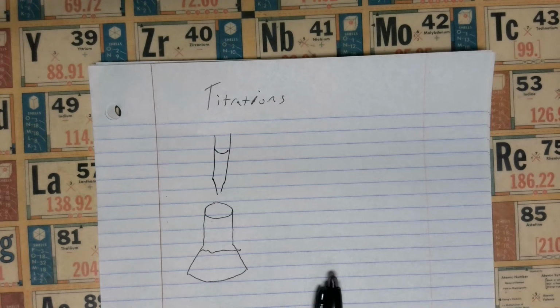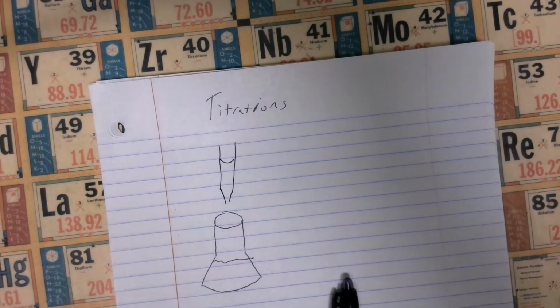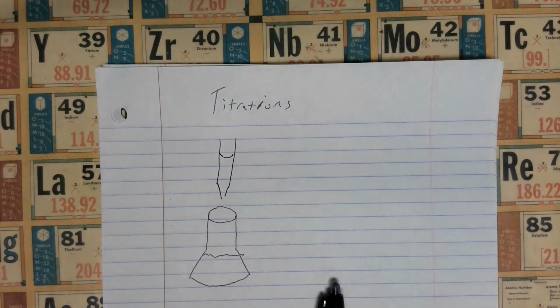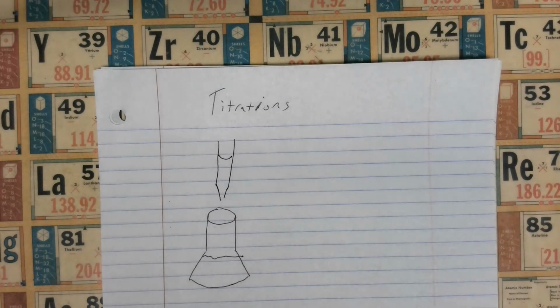All right, so today we're going to get into titrations. Titrations are something that we use when talking about acids and bases, and it's a way that we can determine if we have an unknown concentration of either an acid or base. We can figure out what that concentration is by reacting it with something that has a known concentration.